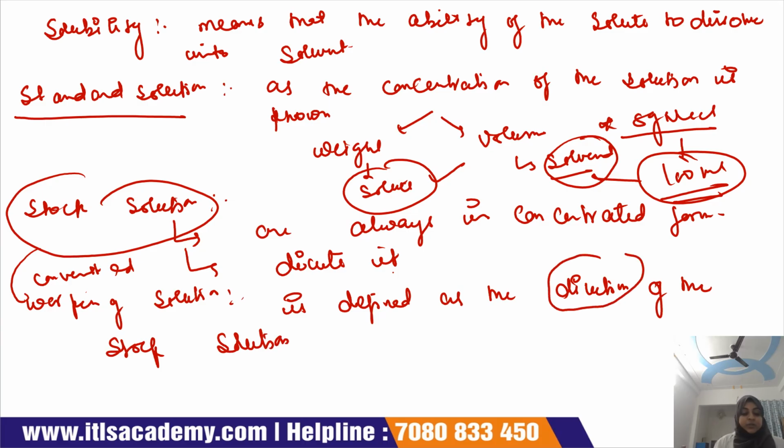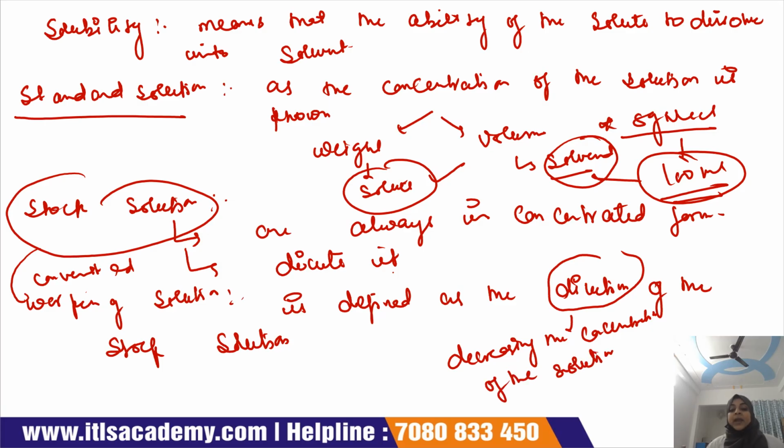Now, what does this dilution mean? Simply, dilution is when we decrease the concentration of the solution. And how do we decrease the concentration? By adding solvent, and especially the solvent is water. This is about the dilution, working solution, stock solution, and standard solution.